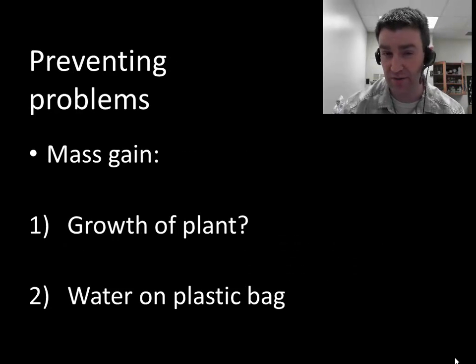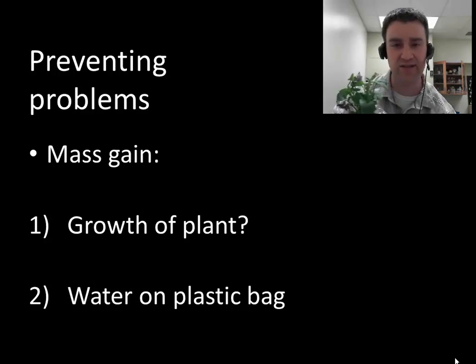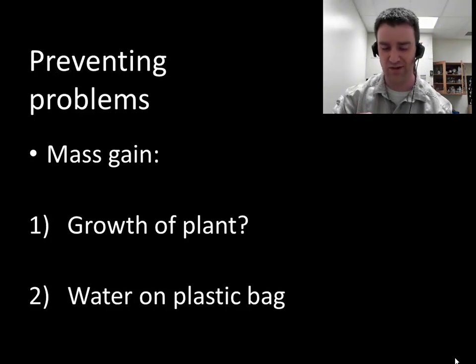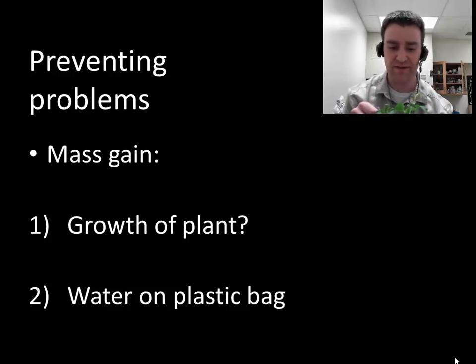To make mass loss a reliable measure, we need to prevent other factors that could cause the plant model to change in mass. Could the plant grow and gain mass? Hopefully not in the course of a week, especially if the pansy plants are already somewhat mature. We can keep that in check by pinching off where they grow — flowers tend to grow in fast, so we'll pinch off the flowers at the base of the stem and any buds that could become future flowers.